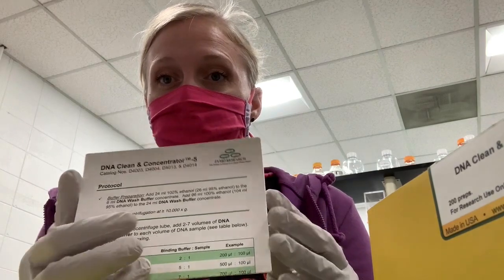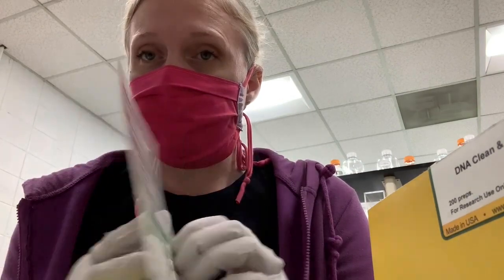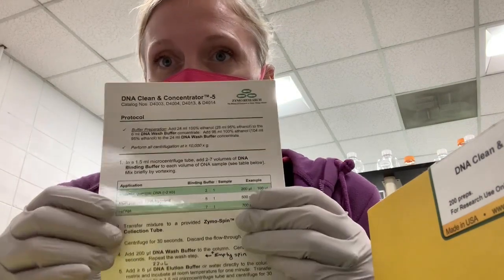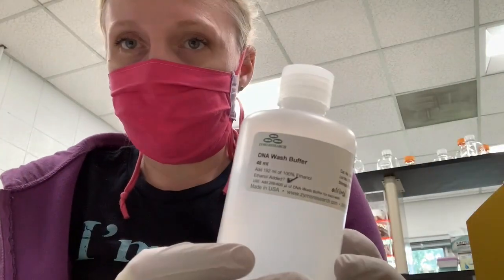These kits are pretty nice because they include a protocol with them. So you can see inside the box, there's one of these. You can also look this up online and print out your own copy if you'd like. And it will tell you all of the steps that you need to do for this method. The kit will also have a few other things in it. It will have DNA binding buffer, and it will have DNA wash buffer.